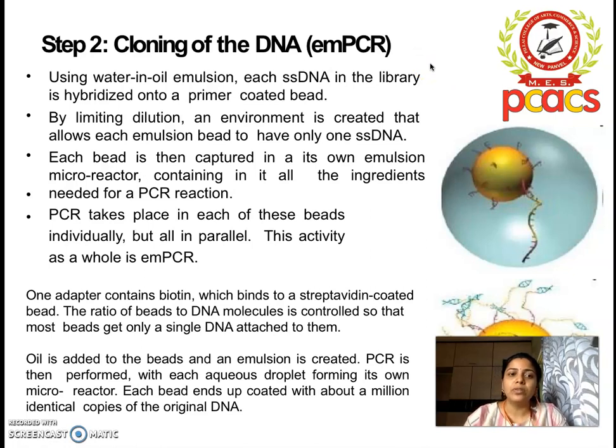So let us see. This uses a water in oil emulsion. Everyone knows that oil and water do not mix together, but what is an emulsion? When you drop oil droplets in water and mix it rigorously, you will form an emulsion. Such a mixture is produced in this method also. Each single stranded DNA in the library is then hybridized onto a primer coated bead. So here you create an environment. These beads, which we have seen in step one, are now added to such a droplet environment where oil and water are both present.